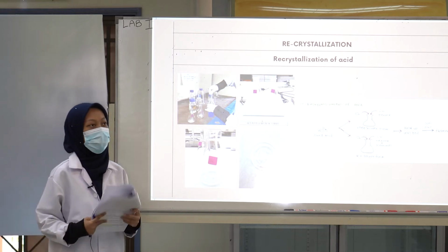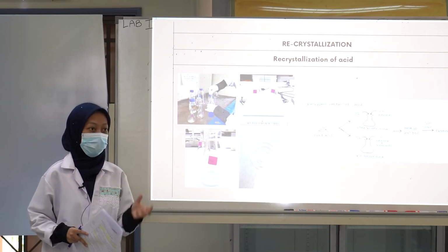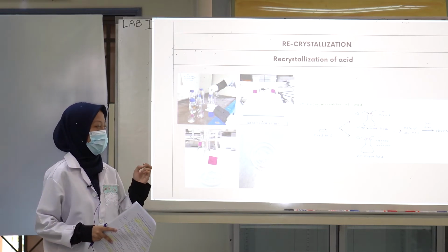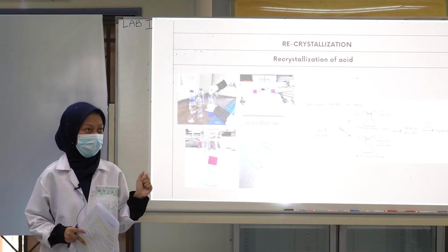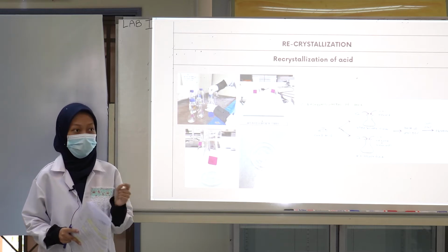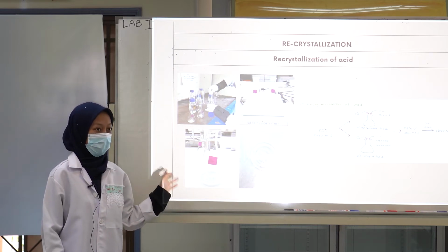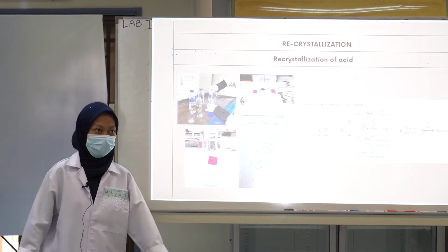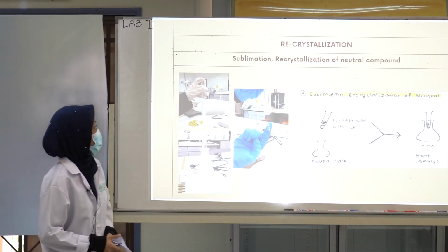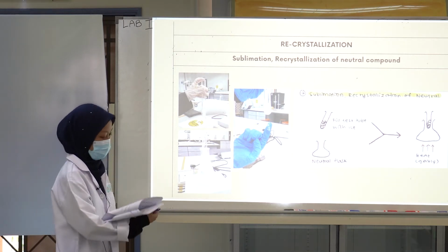There is no crystal form, because actually the solvent that we are supposed to use is 5 milliliter hexane plus 5 milliliter methanol plus water. So that's why we didn't get the crystal form result for the mixed solvent flask.